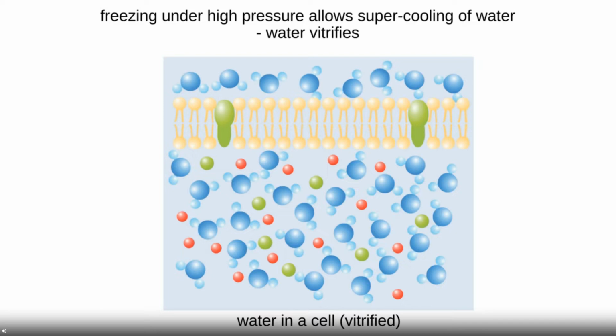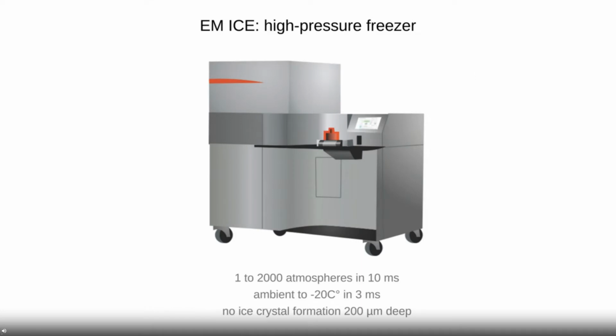This is what we are actually doing by applying high pressure, 2,000 atmospheres, onto the tissues using a high pressure freezer. And then we come in with the liquid nitrogen to freeze the tissues instantaneously. With this approach, we can retain the tissue integrity without compromising the morphology.